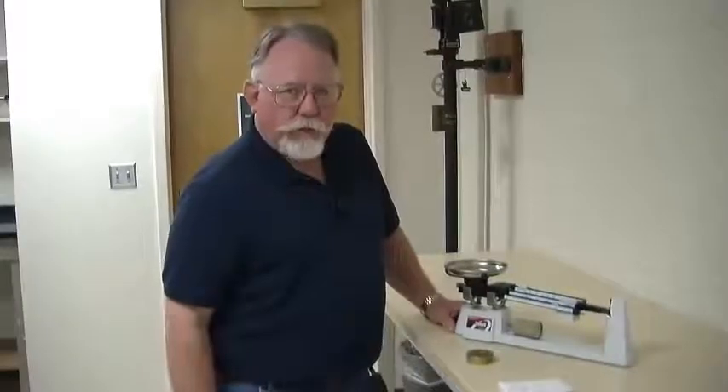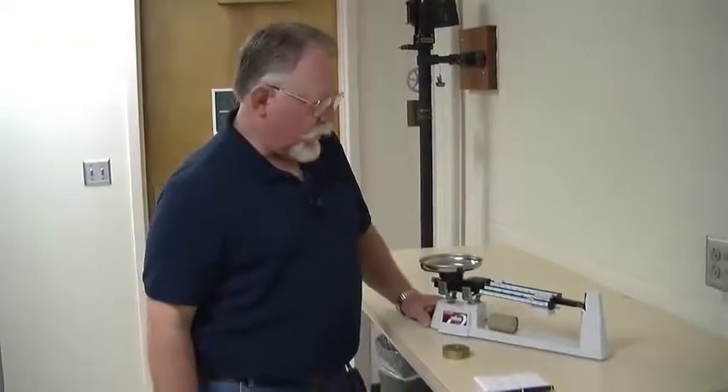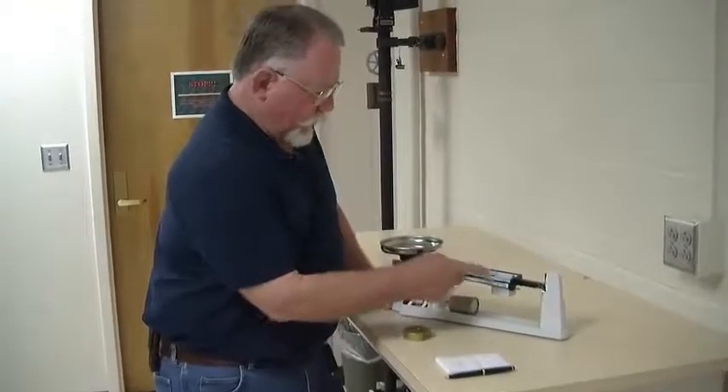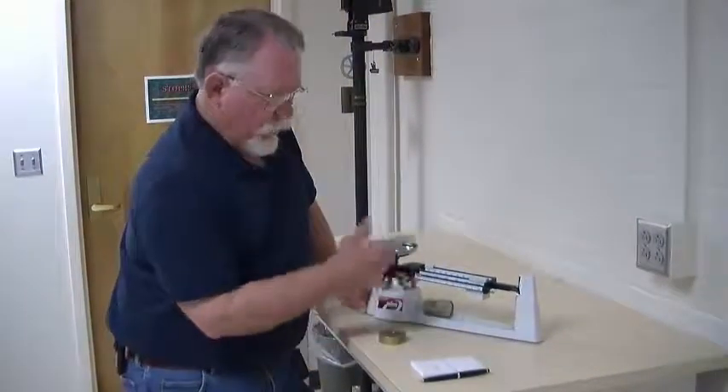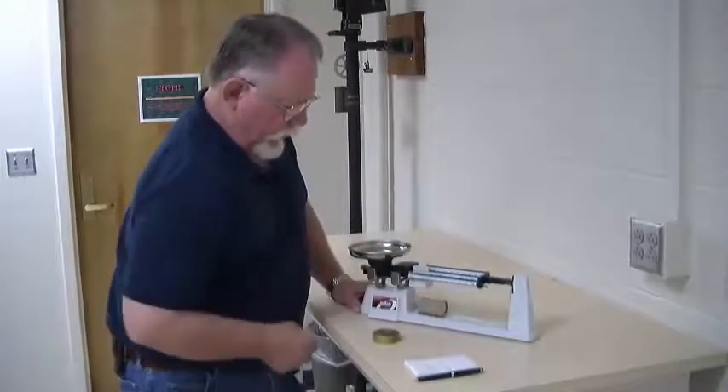The triple beam balance is commonly used in our laboratories to measure mass, and it functions very simply. It has three beams with poised weights, but when you get ready to measure, put them all back to zero.